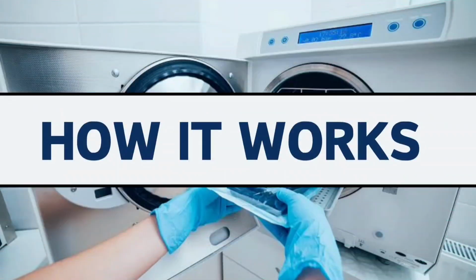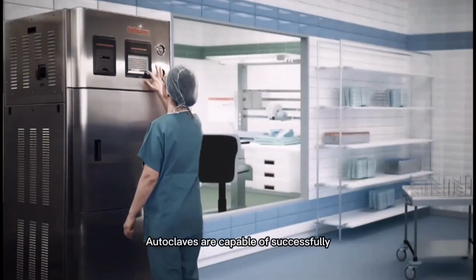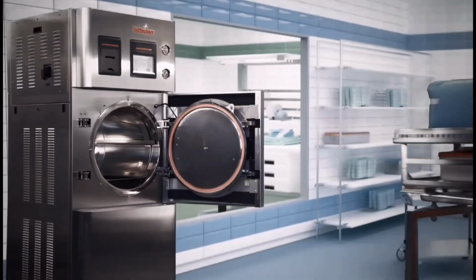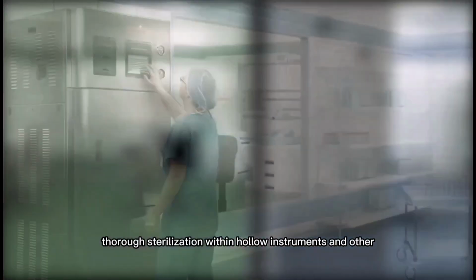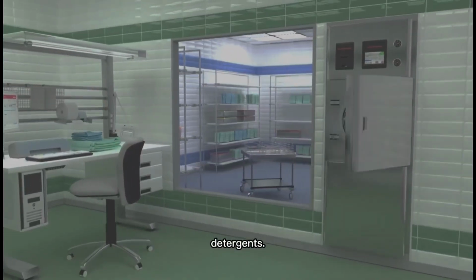Now, let's move on to how it works. The functionality of an autoclave can be simply compared to a pressure cooker, utilizing steam to create a high-pressure environment and maintaining a temperature too high for microbial survival. Autoclaves are capable of successfully eliminating pathogens which may be resistant to soaps and detergents. The pervasiveness of the steam created within the autoclave allows thorough sterilization within hollow instruments and other tiny vents which could be missed during cleaning with detergents.